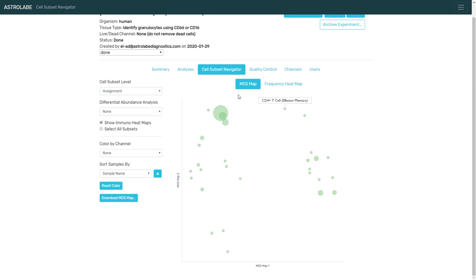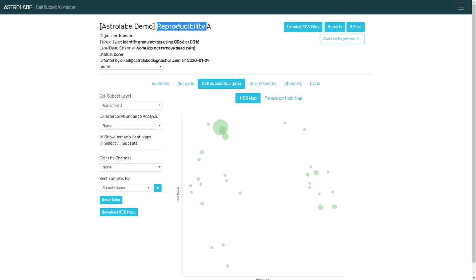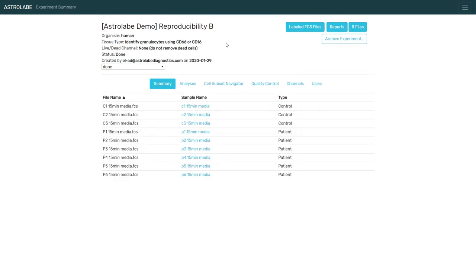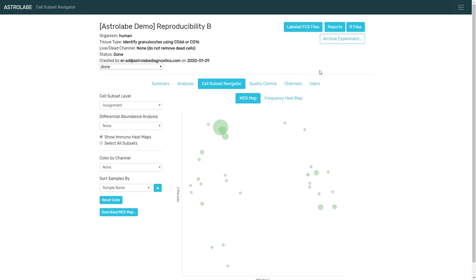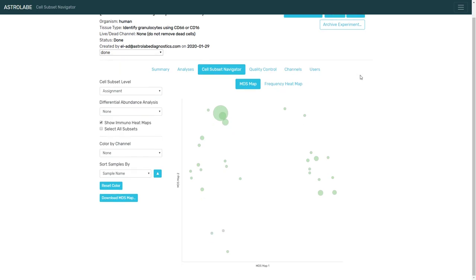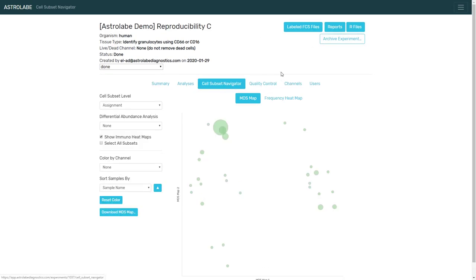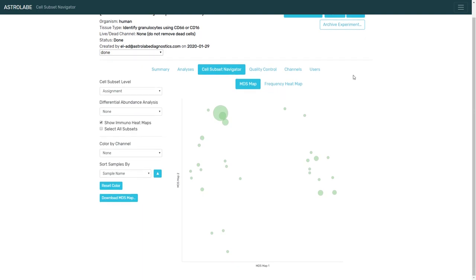And this is the MDS map for the study for reproducibility A. You can think about this as a SPADE plot or a FlowSOM tree or a t-SNE. Here is the MDS map for reproducibility B, and here is the MDS map for reproducibility C. And I'm going to switch between them, which is pretty boring. They're pretty much the same.